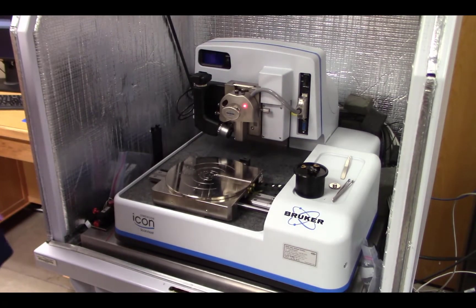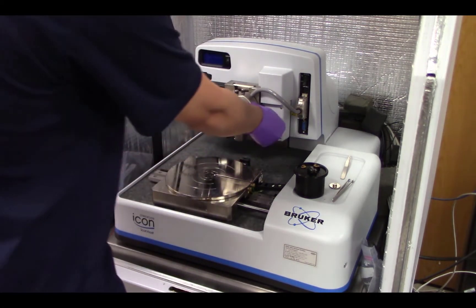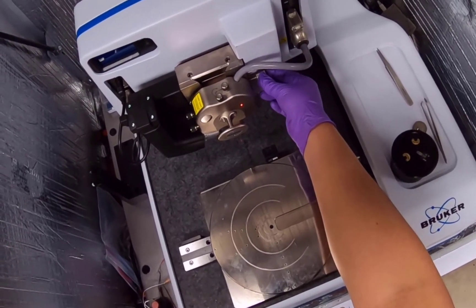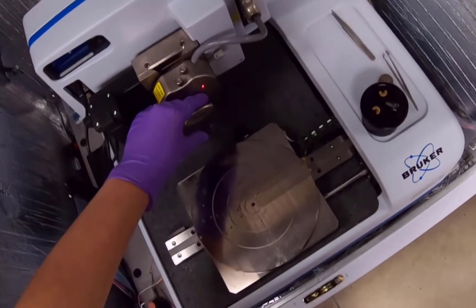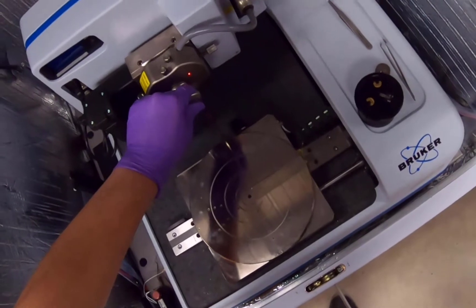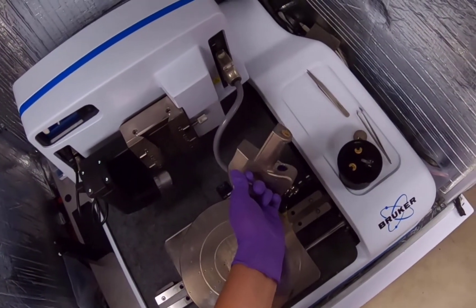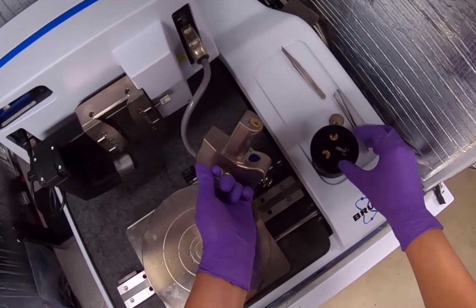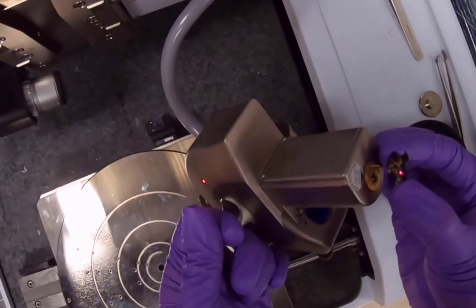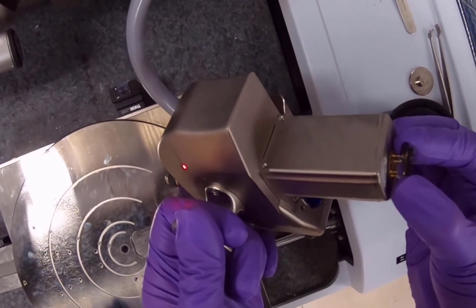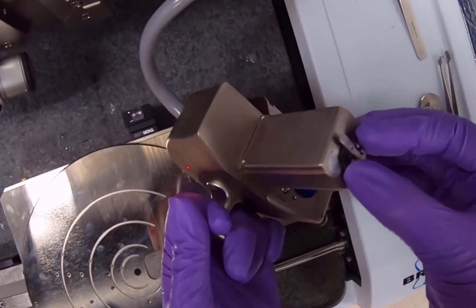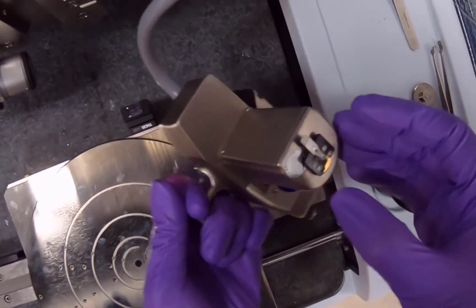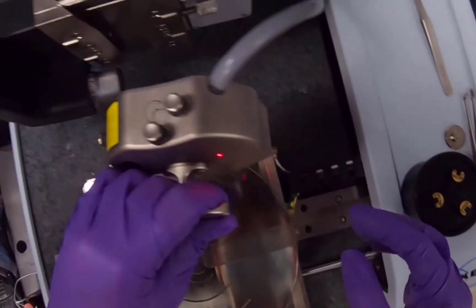To load the probe on the scan head, loosen the scan head set screw by rotating the knurled knob counterclockwise one half turn. Grasp the scan head and gently lift the scan head straight out of the dovetail guide. Using your dominant hand, attach the probe holder onto the scan head pins. This is important: make sure you avoid aiming the laser outside the AFM enclosure. Gently push the probe holder all the way down by pressing on the sides, and make sure to avoid the tip area.